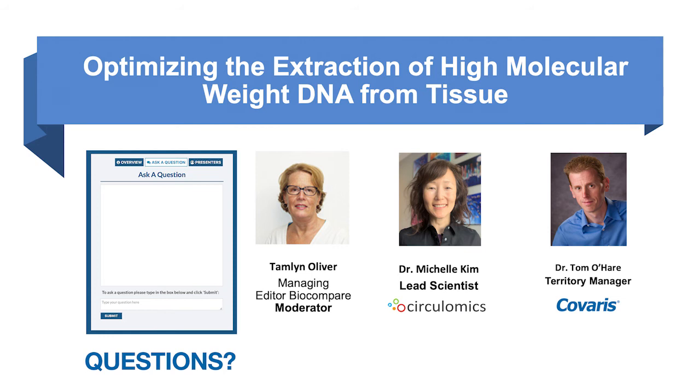Thank you. Mary, I'm going to throw you another question. Obviously, if it's better for Michelle, please just redirect. What tissues are the most difficult to extract from? Well, we already had a question about extracting from bone, and bone is one of the most difficult to extract from because the tissue is so hard. We do have an ultra thick tissue tube bag that helps with hard samples to keep them from piercing the bag. Another type of tissue that is difficult is skin tissue, because it is also very hard and kind of a fibrous sort of tissue.